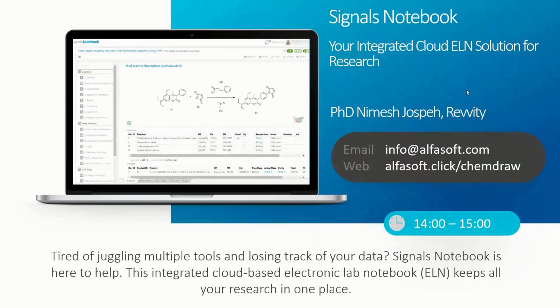Thank you. Oh, yeah, okay. Thank you for the answer, Nimesh. I have one more for you. Can you explain how software updates are done? Sorry, on the tenant, and how to find information about new functionalities incorporated into the product.